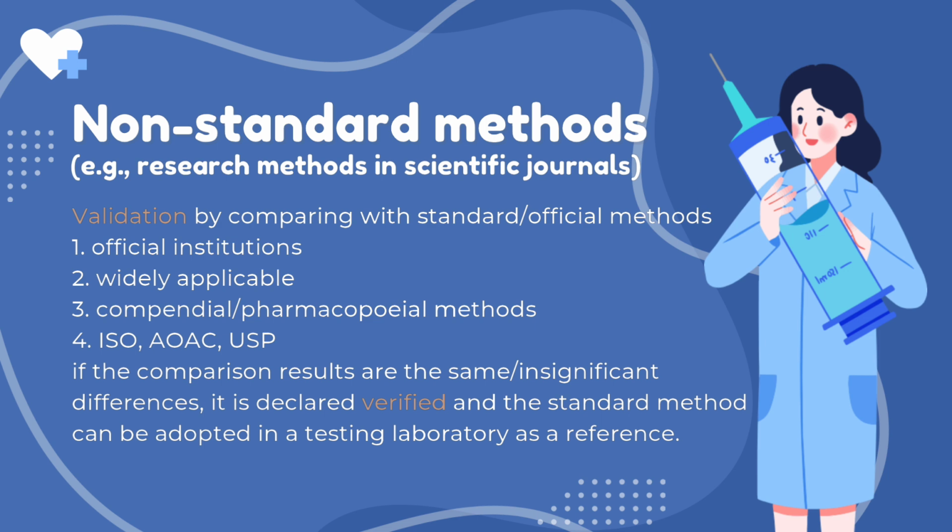Standard methods are: 1. From official institutions. 2. Widely applicable. 3. Compendial pharmacopoeial methods. 4. ISO, AOAC, USP. If the comparison results are the same, with insignificant differences, it is declared verified and the standard method can be adopted in a testing laboratory as a reference.